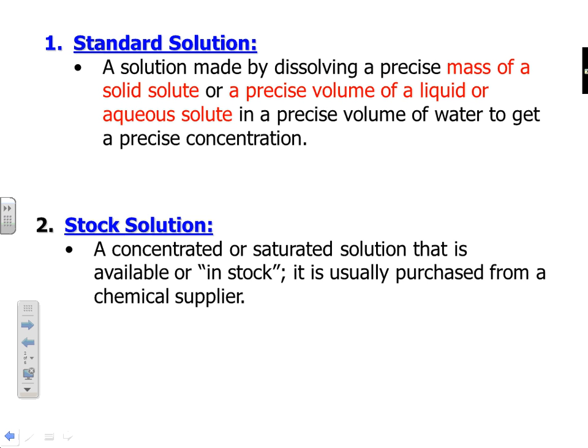That means we can know it down to the 100th of a gram. This is the most precise scale that we have in the school, all right? That means we will know the mass to as precise a knowledge as we can possibly have. When I was in university, we used a scale that went down to 4 decimal places. That's the 10,000th of a gram.